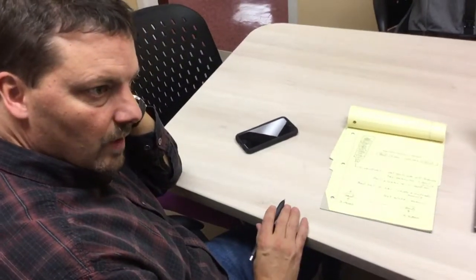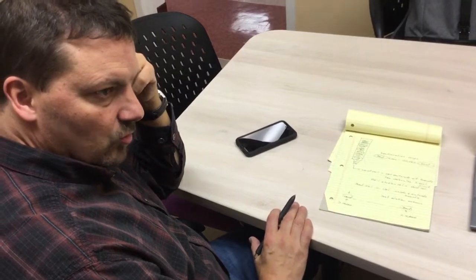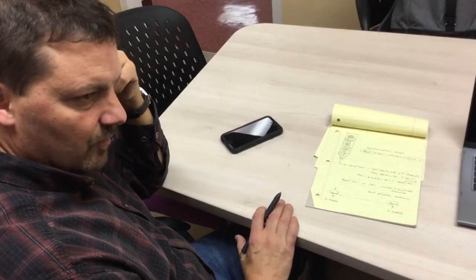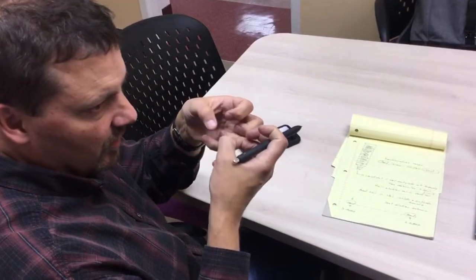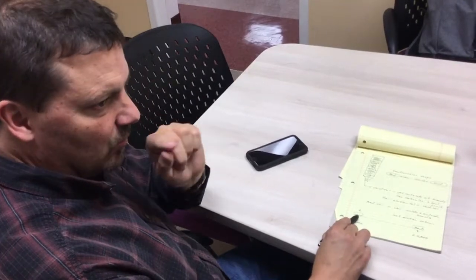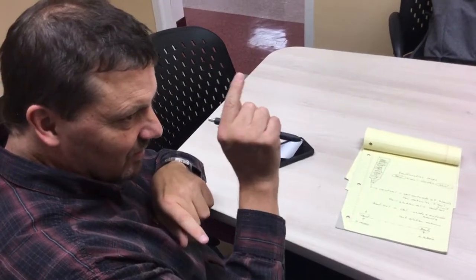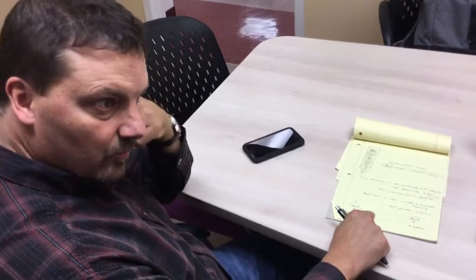So we use this to determine the size of the beta-galactosidase. If it was any kind of a multimer, a dimer, a trimer, a tetramer, it would come out in the void volume. If it was a monomer, it would have some access to the beads and it would come out sometime after the void volume.